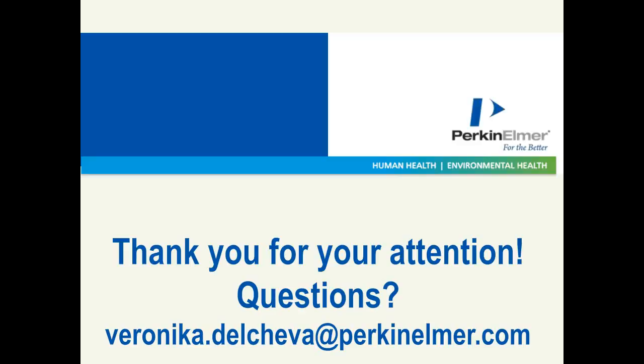Okay. Certainly, our experience at PerkinElmer is that it really depends on the type of gel that you're using, but also the number of samples that you're doing. There are different manufacturers of precast gels, and if you're running anywhere above 4 to 8 samples a day, the cost per sample tends to be around about the same for a median-priced slab gel for nucleic acids.